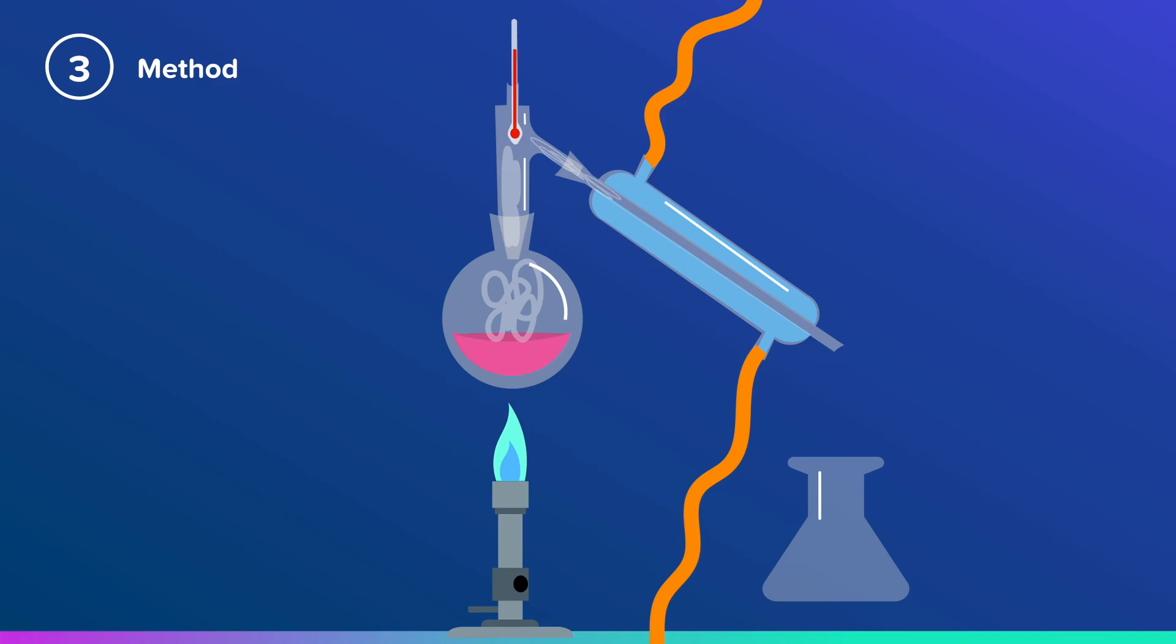As the water evaporates, it travels up through the three-way adapter, and then down the condenser. The water in the condenser cools down our liquid, turning it from a gas into a liquid, making it condense to change state. That liquid drips its way down the condenser and then into the conical flask.